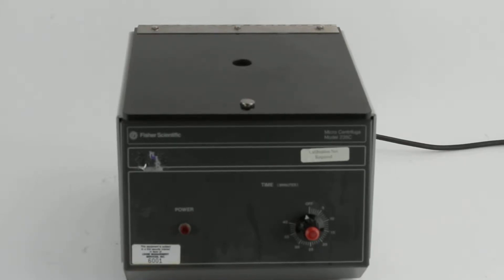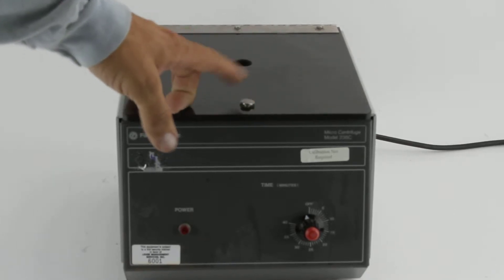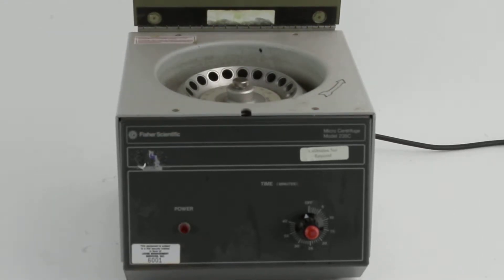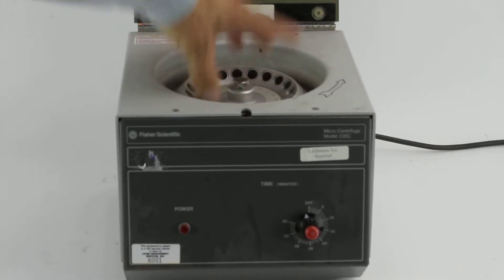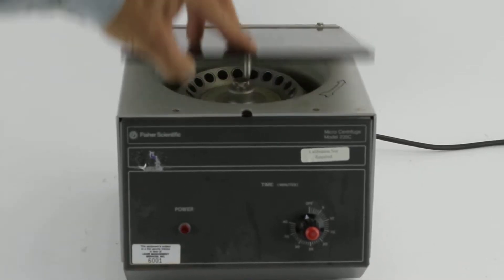This is a Fisher Scientific 235C Micro Centrifuge. I'm going to show you the fixed part right there. It's for small test tubes.